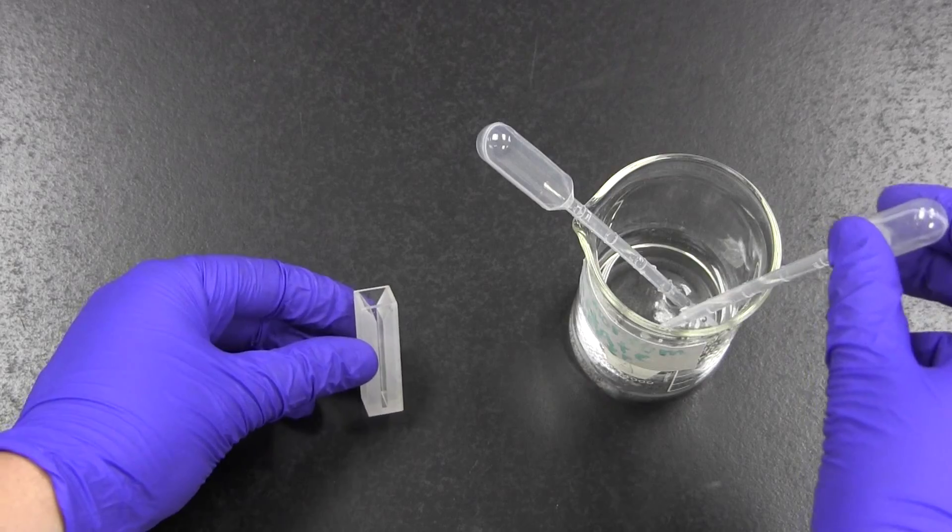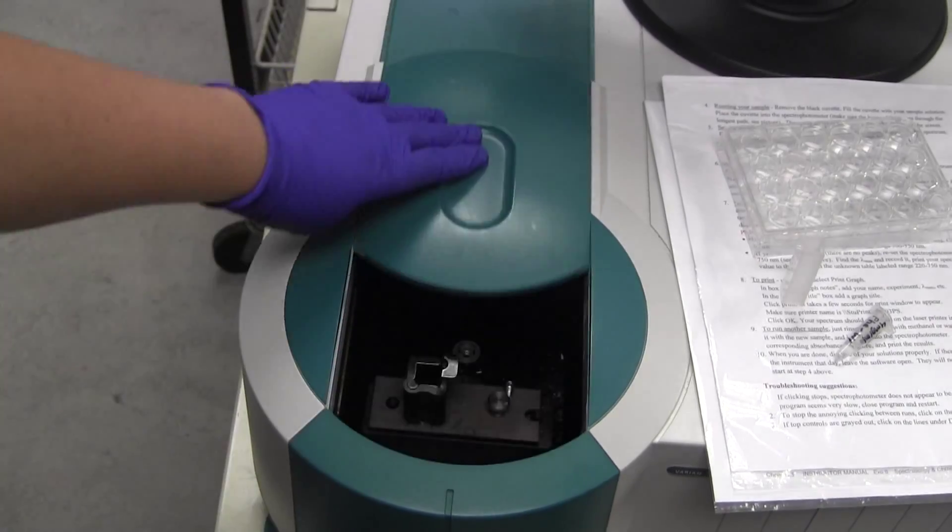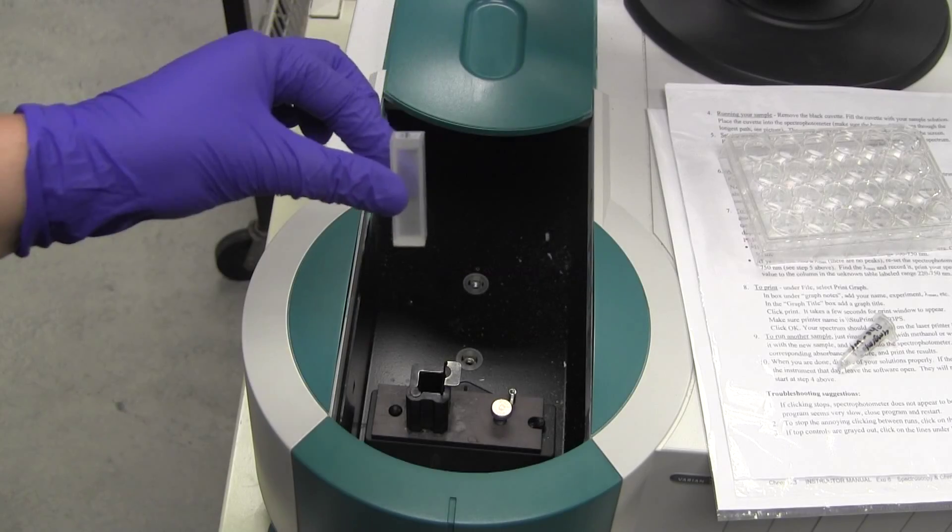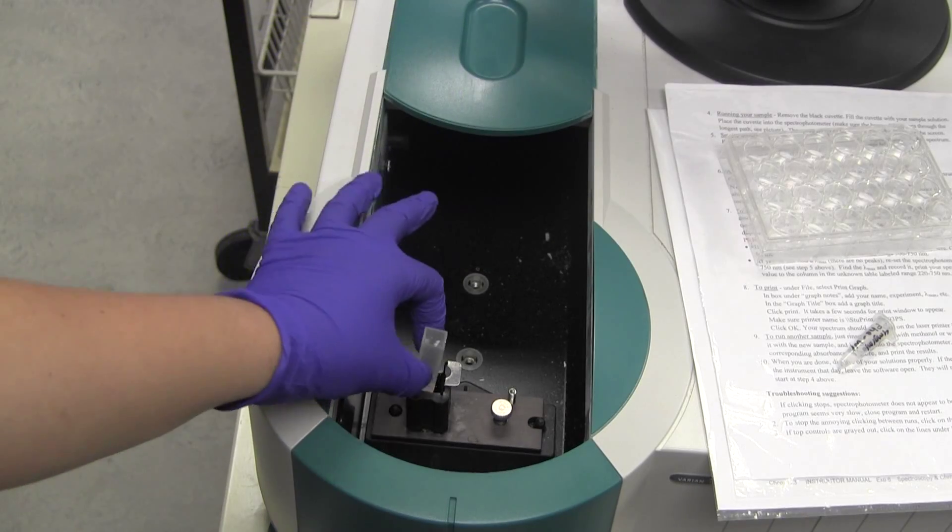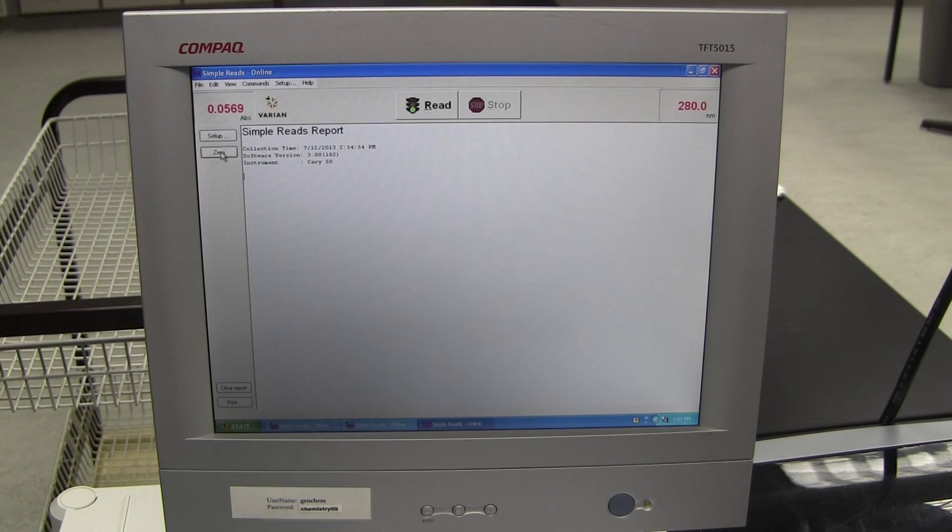To zero the instrument, fill a cuvette with the plain buffer and place it into the instrument. Make sure that the clear channel is facing the path of the light. Close the instrument and press the zero button. Some people choose to press this a couple times.